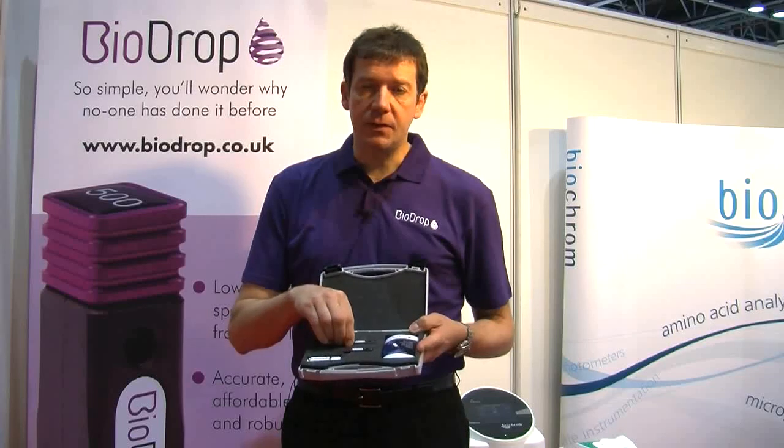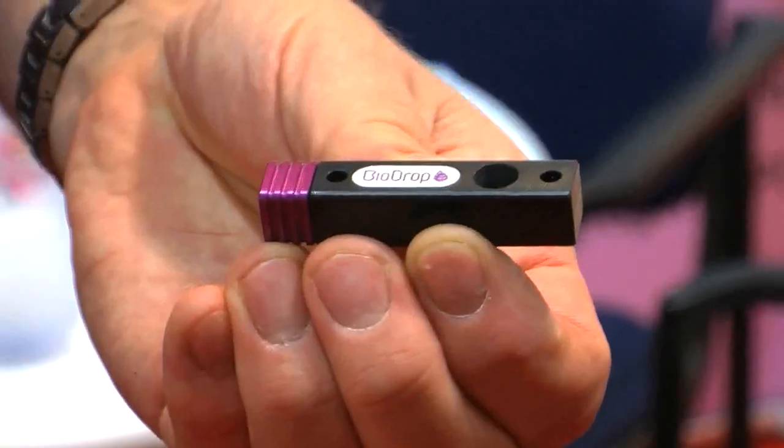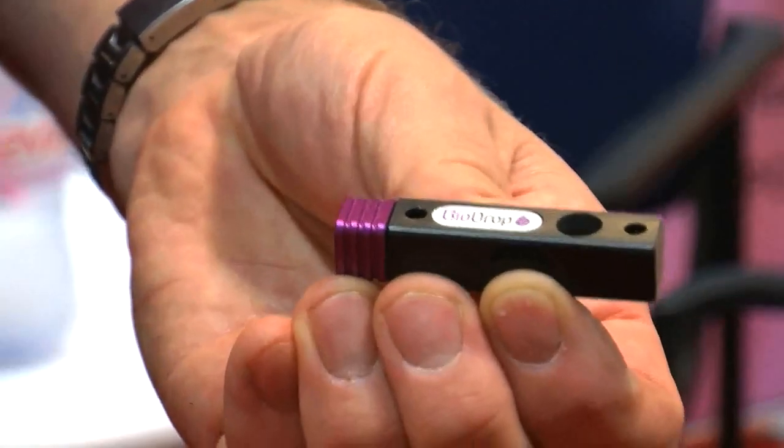One of the big issues you face with cuvette-based solutions is ease of cleaning and amount of light throughput. What you can see on this is there's a huge opening on the front to get the light through, so you get lots of light through the sample — and in spectroscopy, more light through the sample always means better measurements.